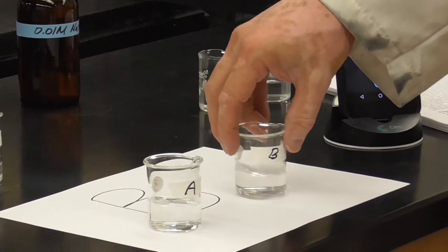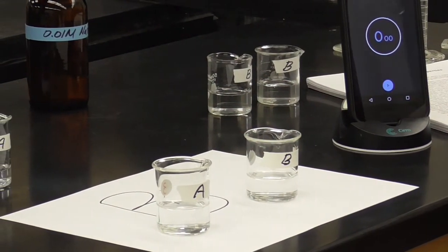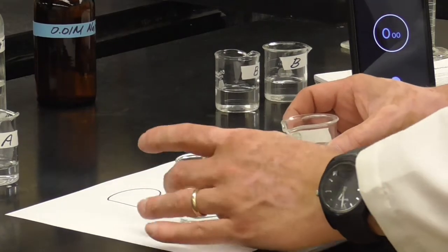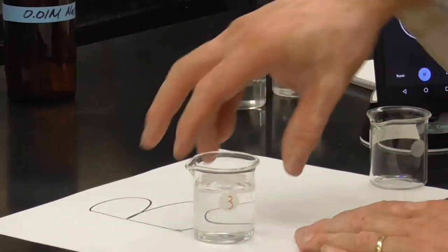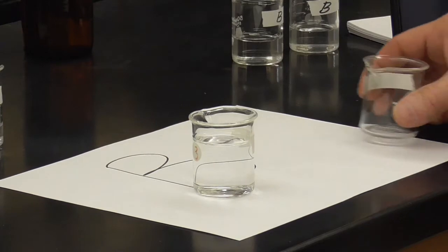All right, so our 2 beakers are ready to go. Now we combine them together and we put the timer on to see how long it takes for the color to appear. Pour the B into the A, give it a swirl and start the timer. Start the timer there.